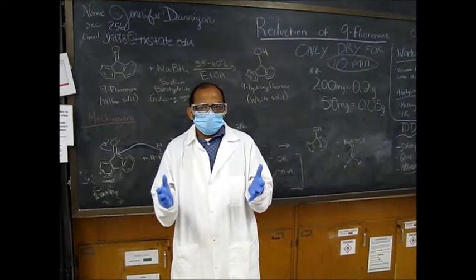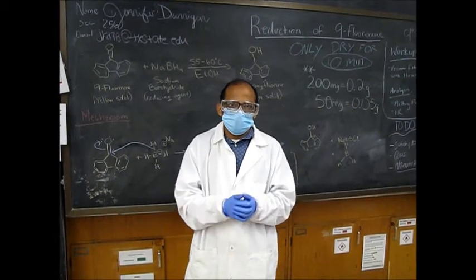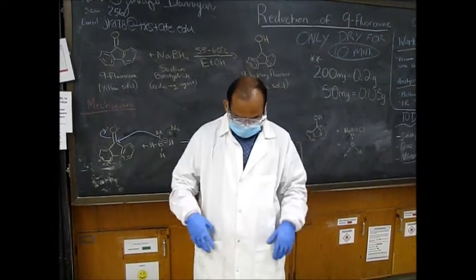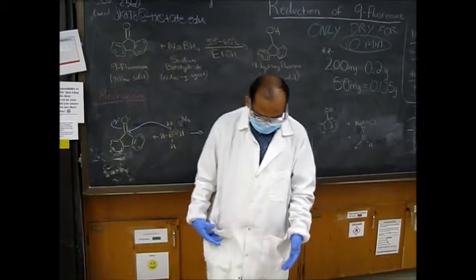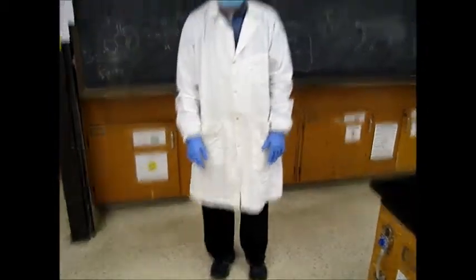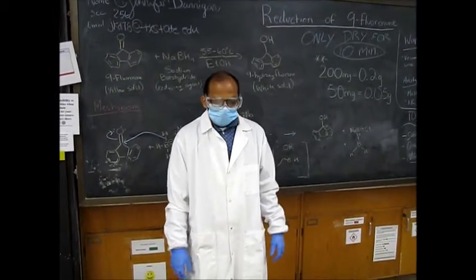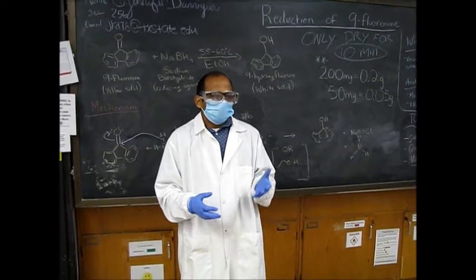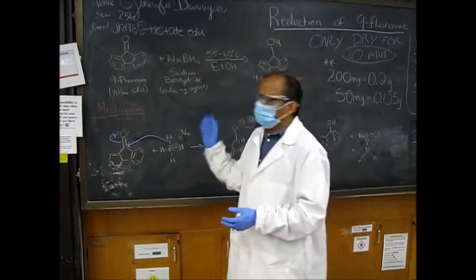Whenever we work in the lab, always use all the protective equipment: your goggles, gloves and lab coat, and your shoes must be toe covered. So now you are ready to work in the lab. Let's start this reduction reaction now.